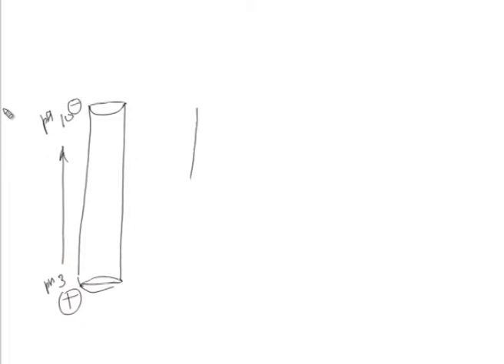So, what is done next? Here you have to load your sample protein. Now, remember protein could be loaded anywhere, but it could be loaded on one side. You have a particular pH here, and negative and positive electrodes.